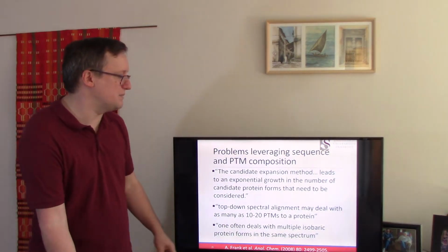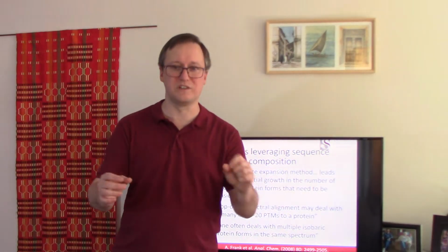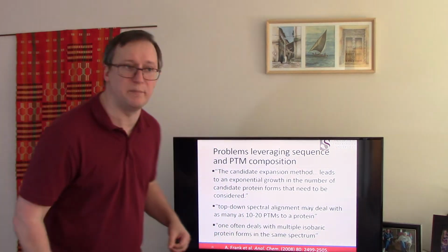So the candidate expansion method, this is the case where we know that a small set of sequences along with PTMs accompanying them that could be used to explain a PRSM.